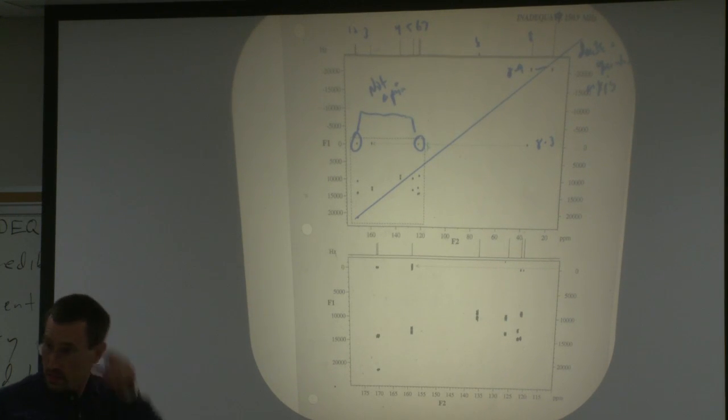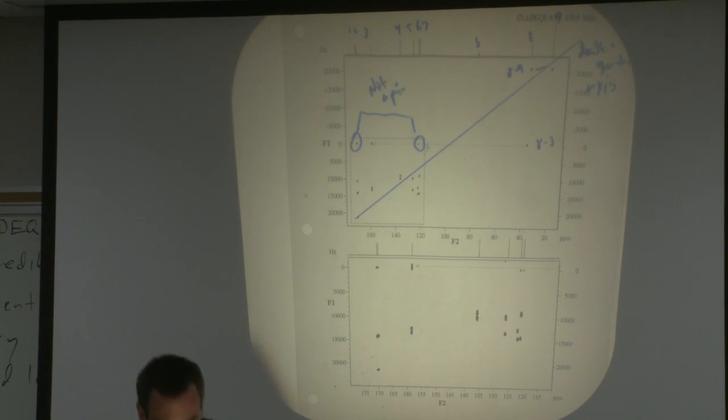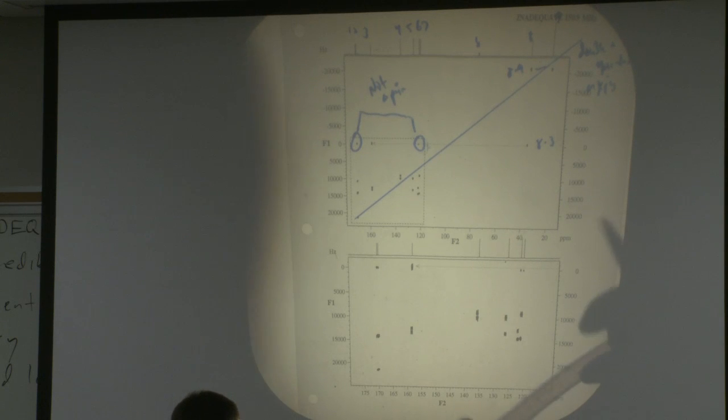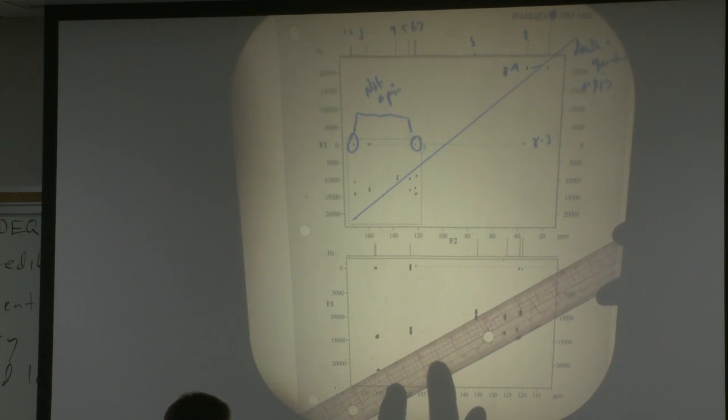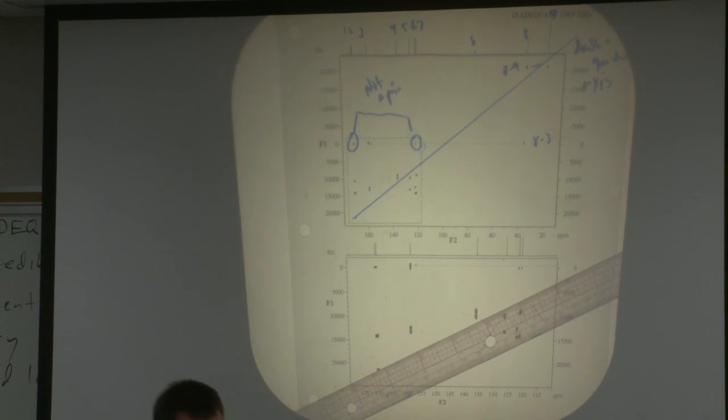Because they're not spaced on that double quantum axis. So it's some type of artifact, but not a product of the double quantum axis. It also doesn't look like a split either. Is that maybe elusive? Oh no. It is something off of.